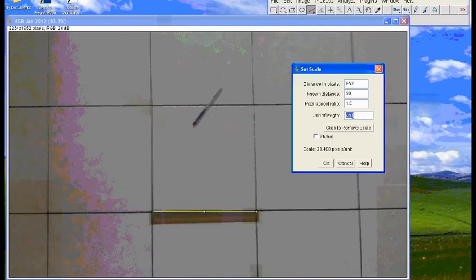Unit of length, you know, numbers without unit are meaningless. That's why you need to define the unit as centimeter. So let's translate to 28.4 pixel per cm. 1 cm equals 28.4 pixel. So okay, and you're basically set to go.